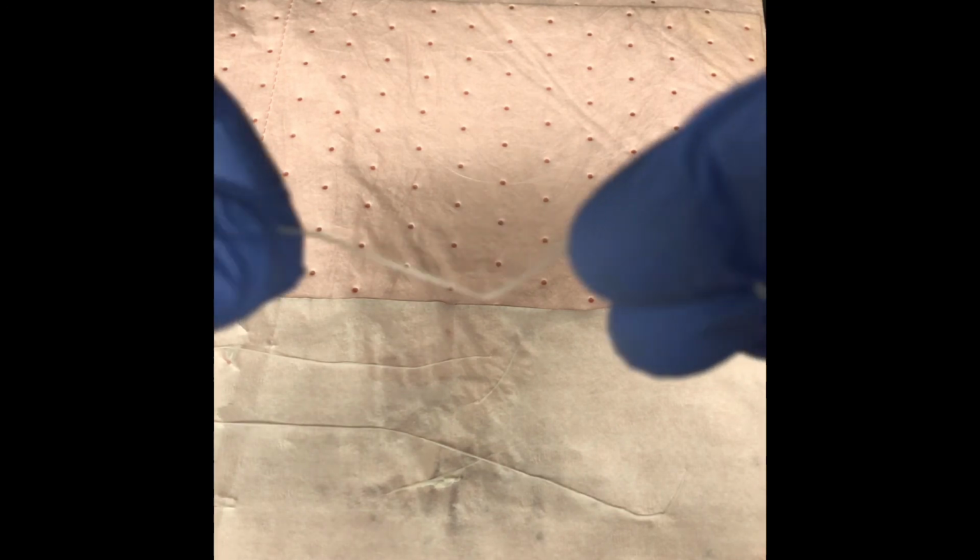One of your questions is, it's useful in clothing. So you have to relate this property of nylon, the stretchability, right? As it gets more and more dry, it's able to stretch more and more without breaking. At first it broke easily, right? But now it's getting really dry. It's really stretchable. I'm putting it out further and further and further, okay?